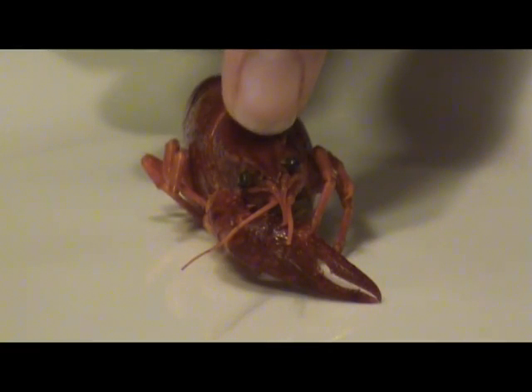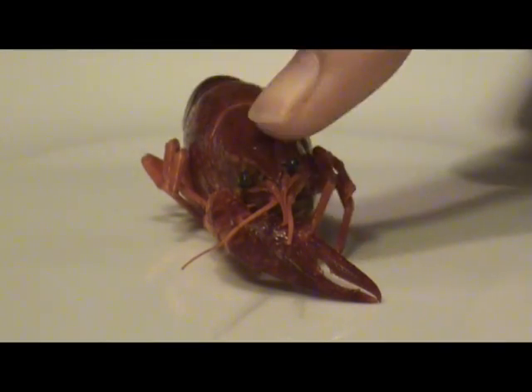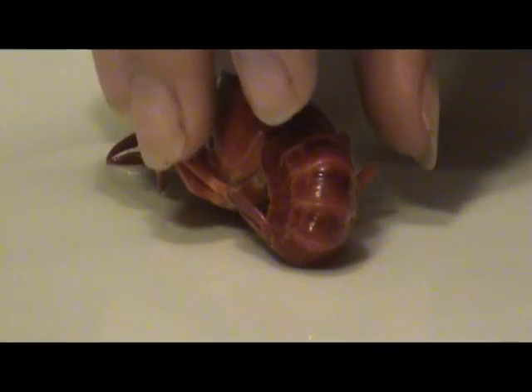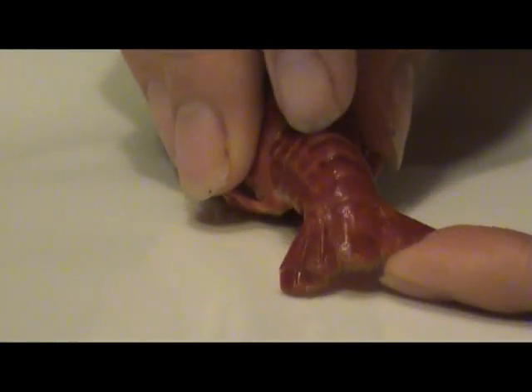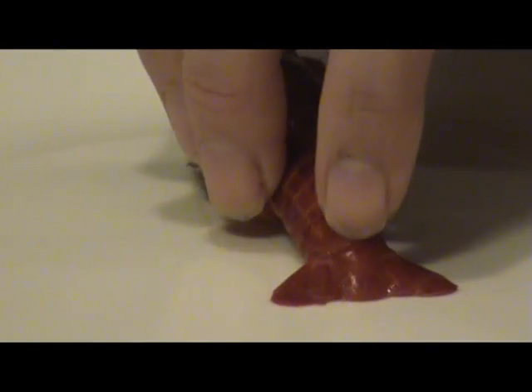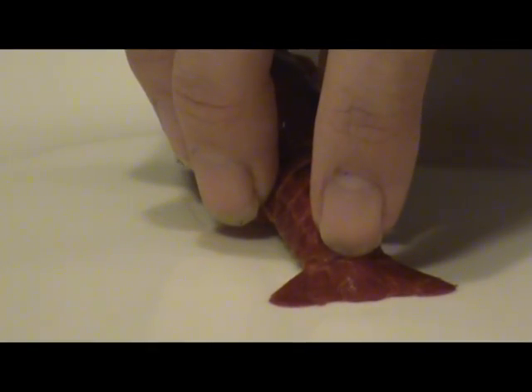Now between the two eye stalks, you'll notice the rostrum — that's this piece right here. Behind the rostrum, we have the carapace. And in the back, we have the abdomen. Each of these scales are called turgum. The very last scale is called the telsin.